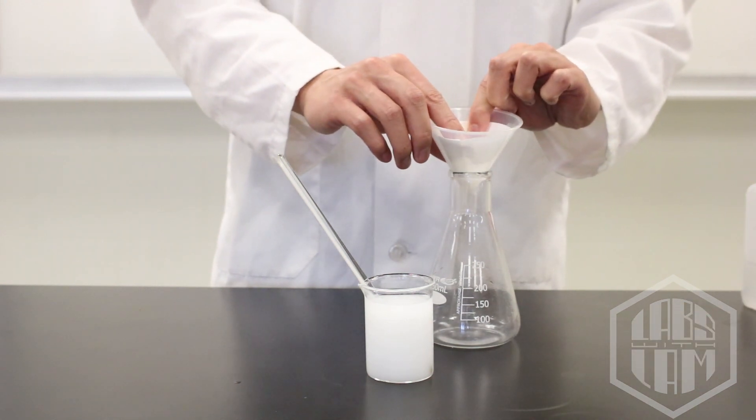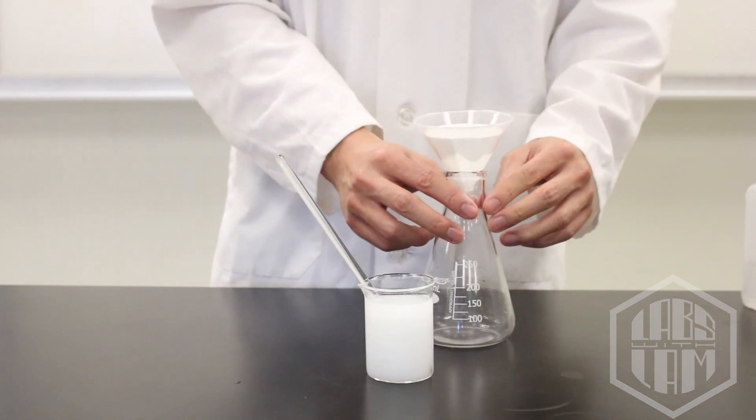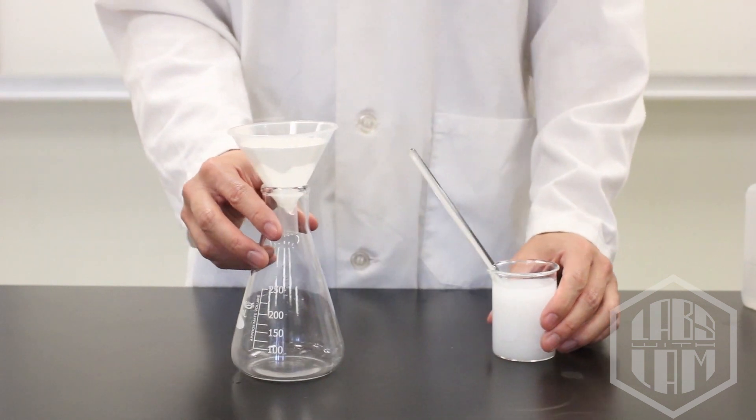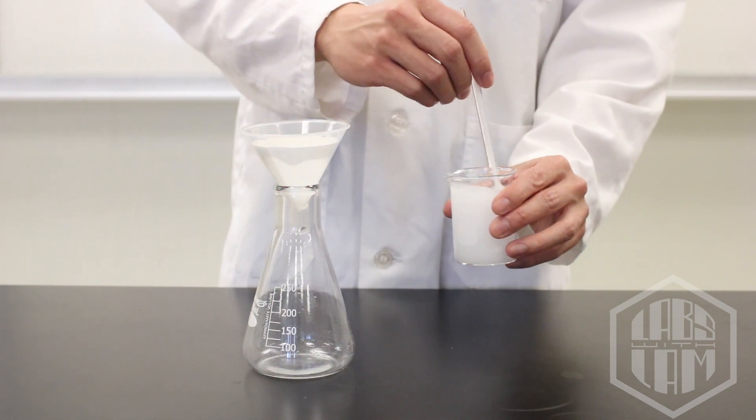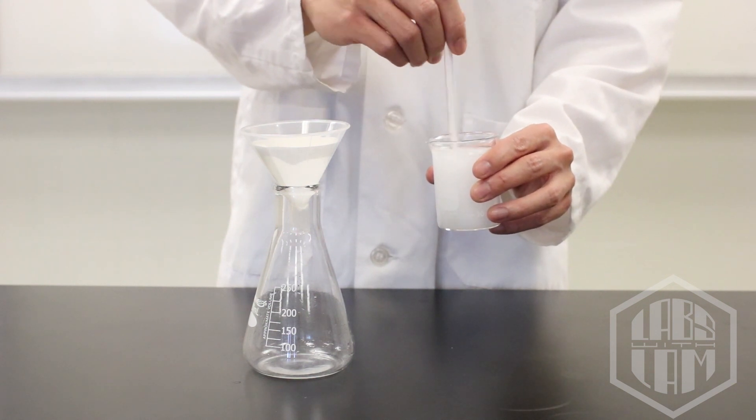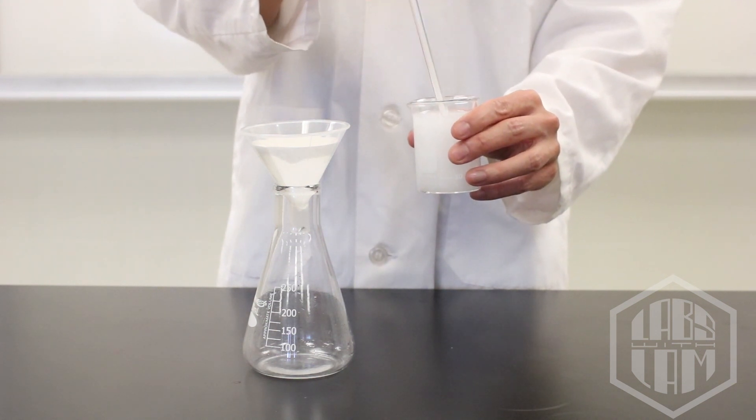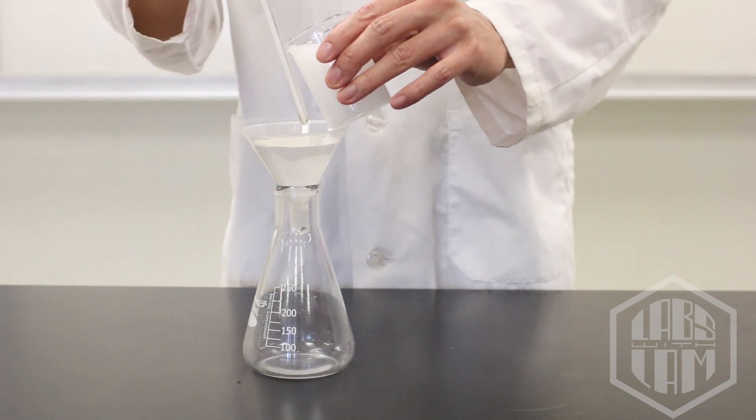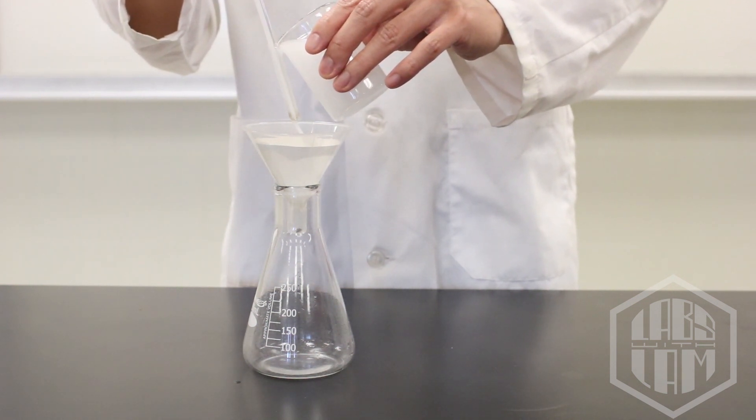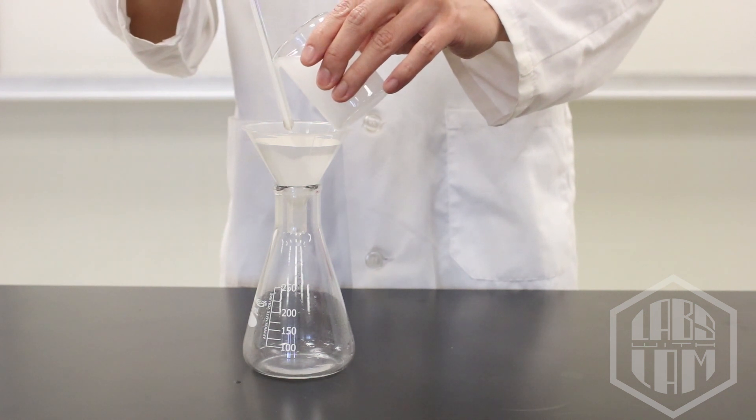I'm going to stir the solution to suspend the precipitate, and then again I'm going to place my stirring rod against the lip of the beaker as I pour to minimize any spilling. It's a pretty useful trick.